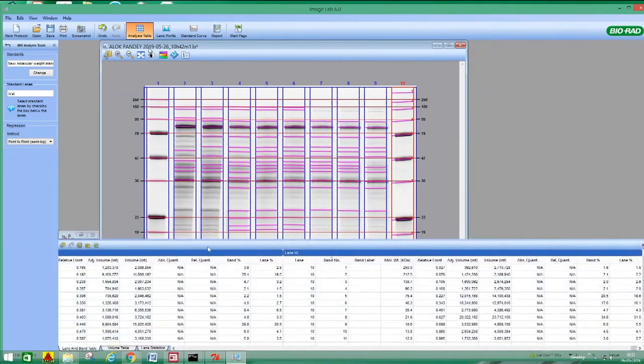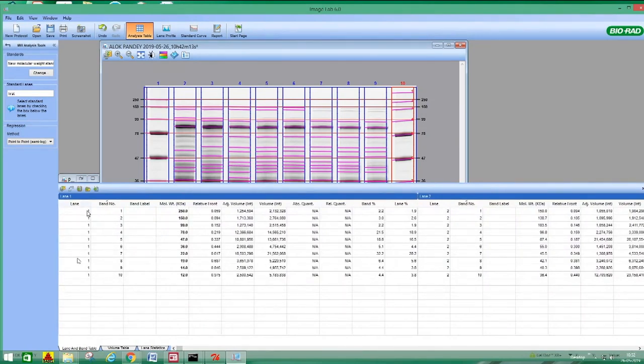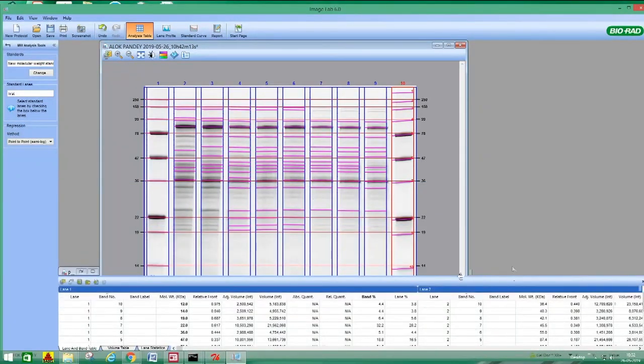You need not worry about anything, you just go to the analysis table. Here the analysis table will give, for each and every lane, details with proper band percentage and lane percentage. Suppose in first lane, lane 1, it corresponds to molecular weights, from lower weight to higher, the different values, and absolute quantity, which we will see in the next part. And band percentage, how much percentage it is, these things we can see.